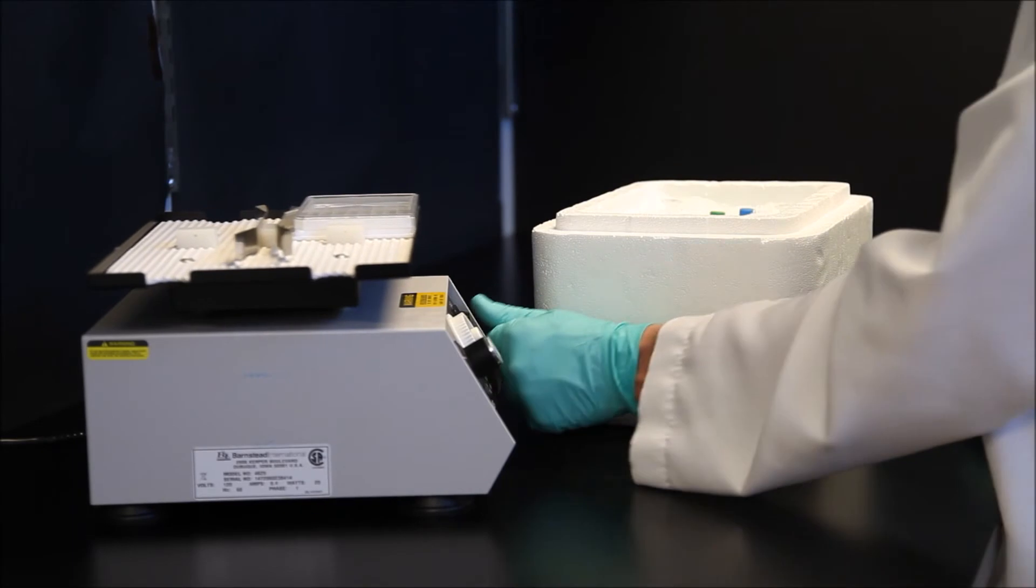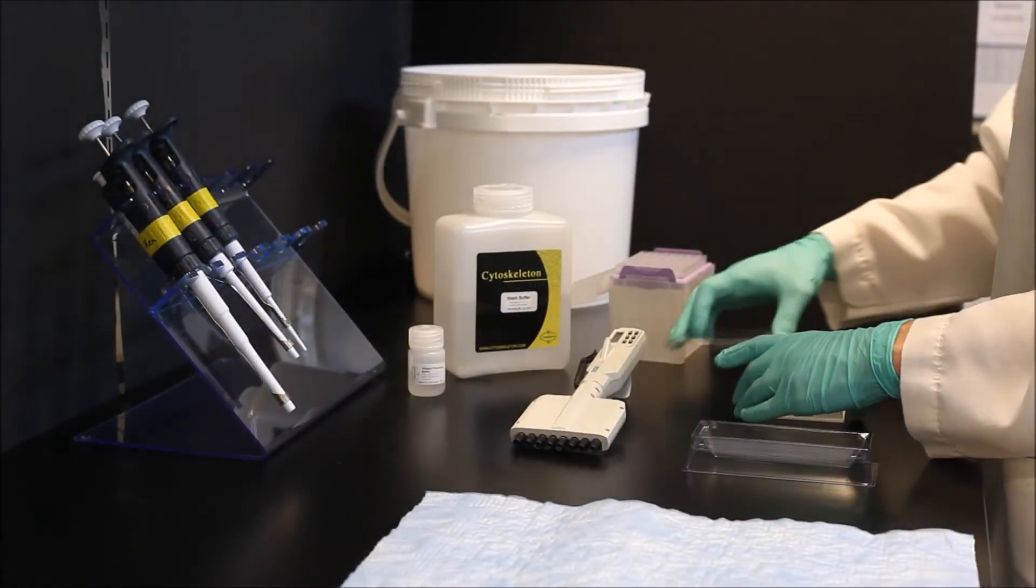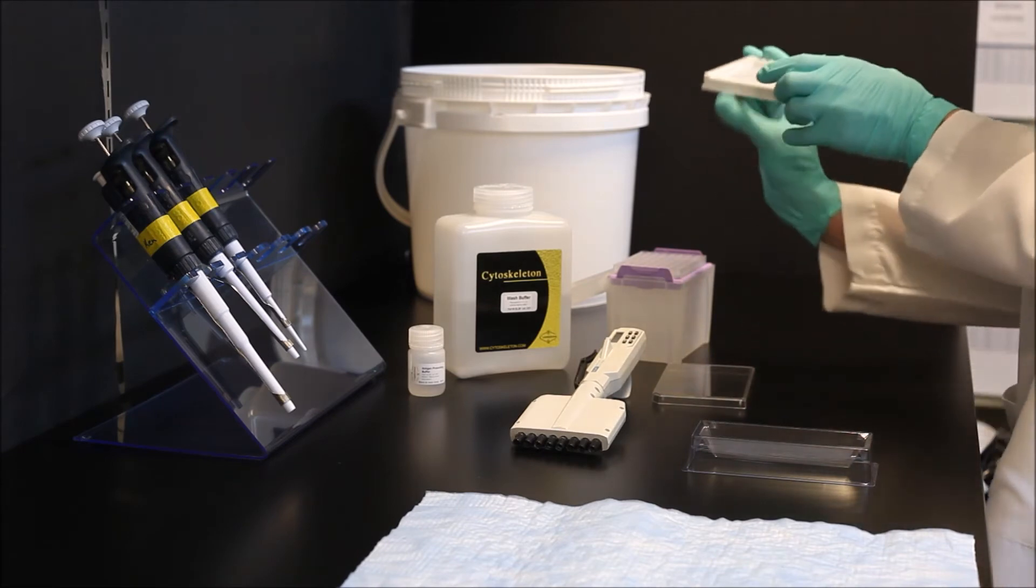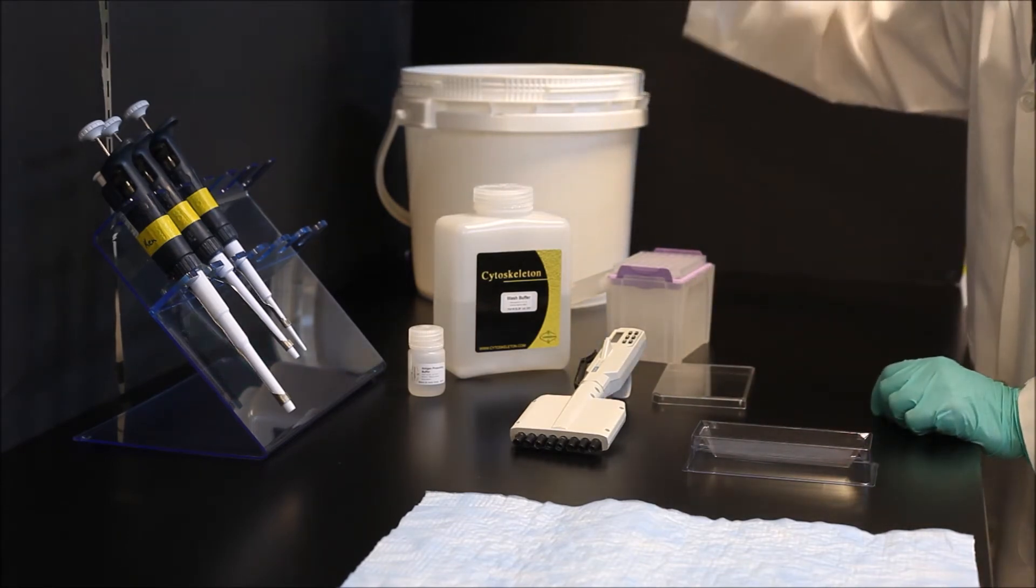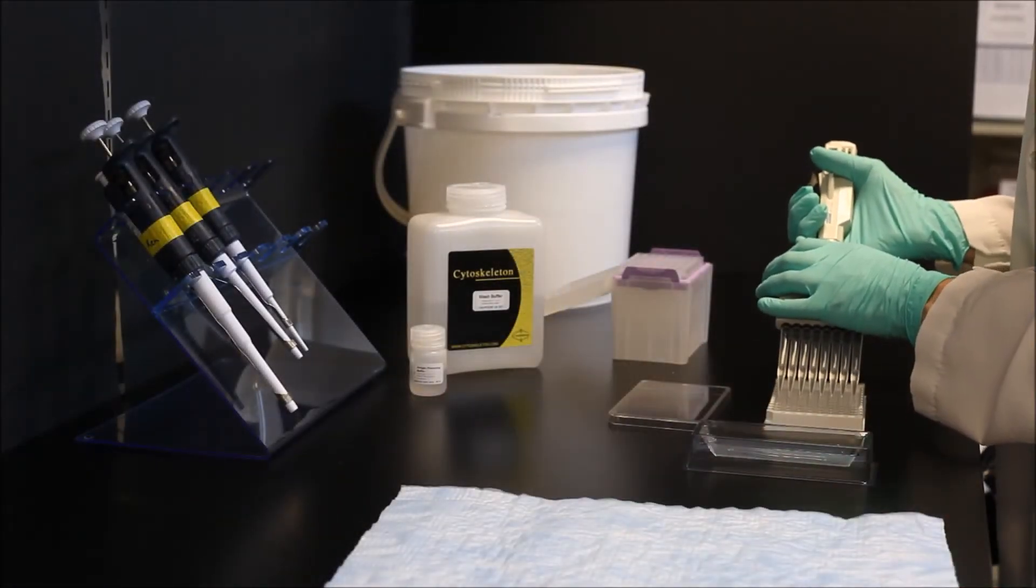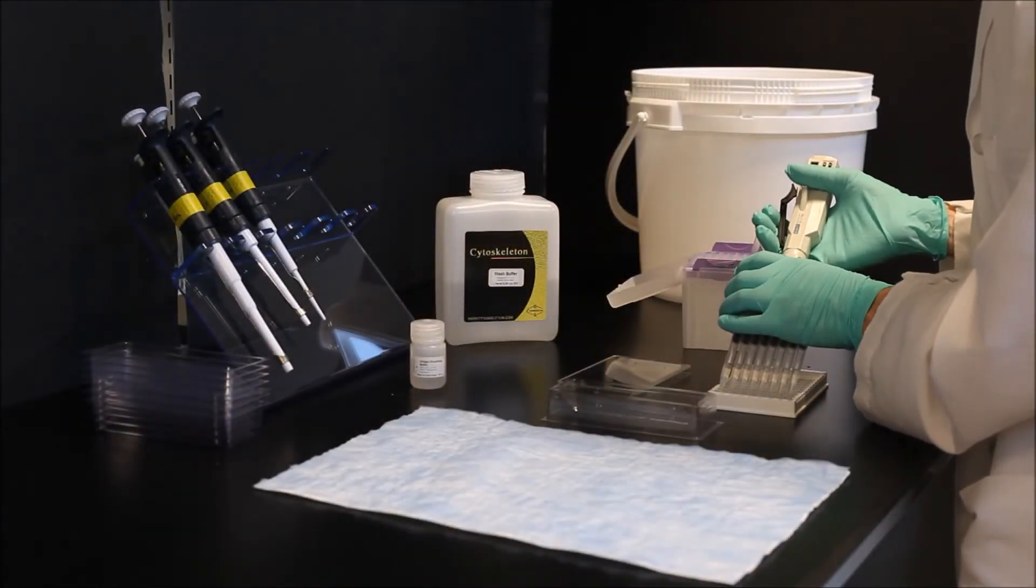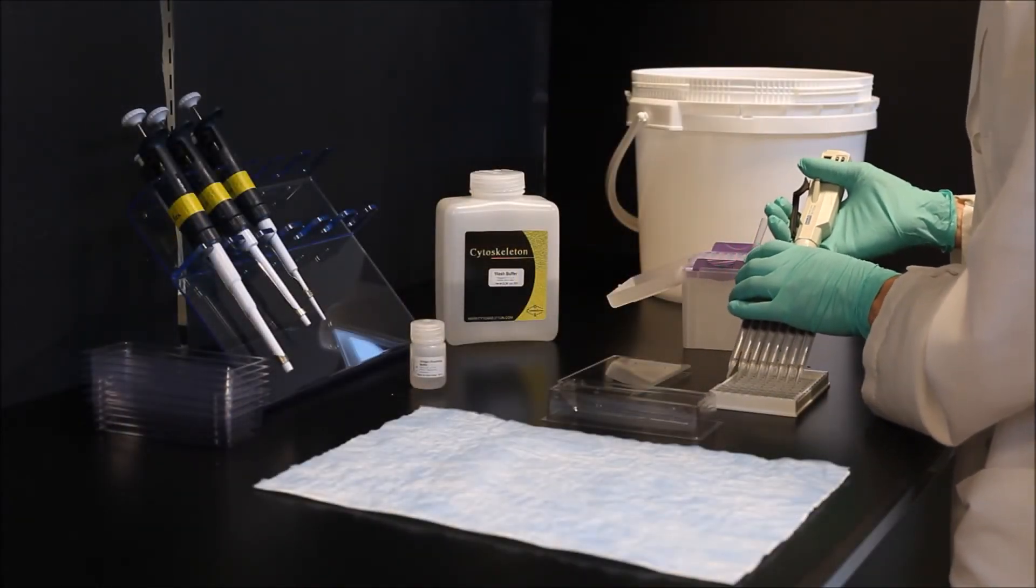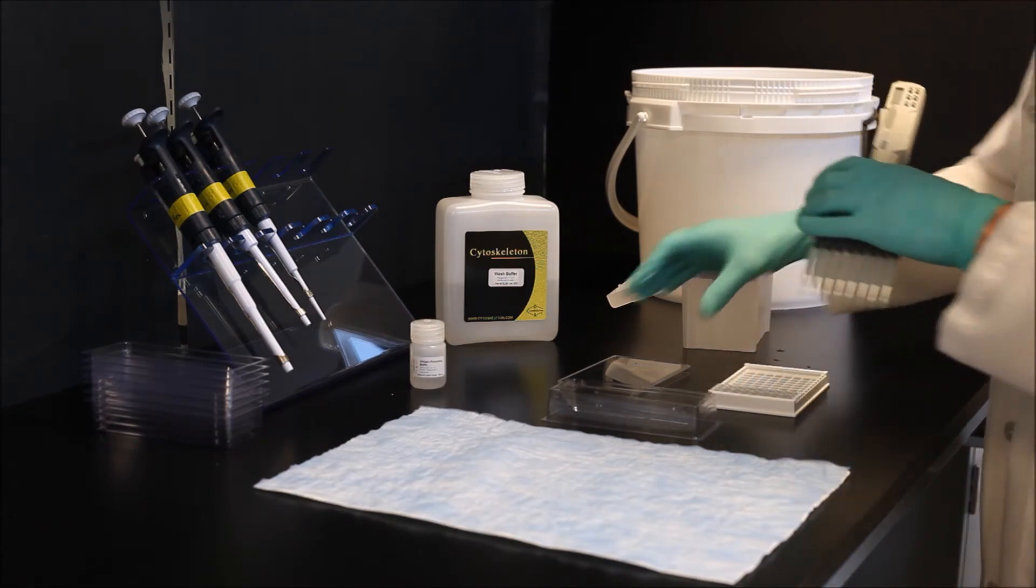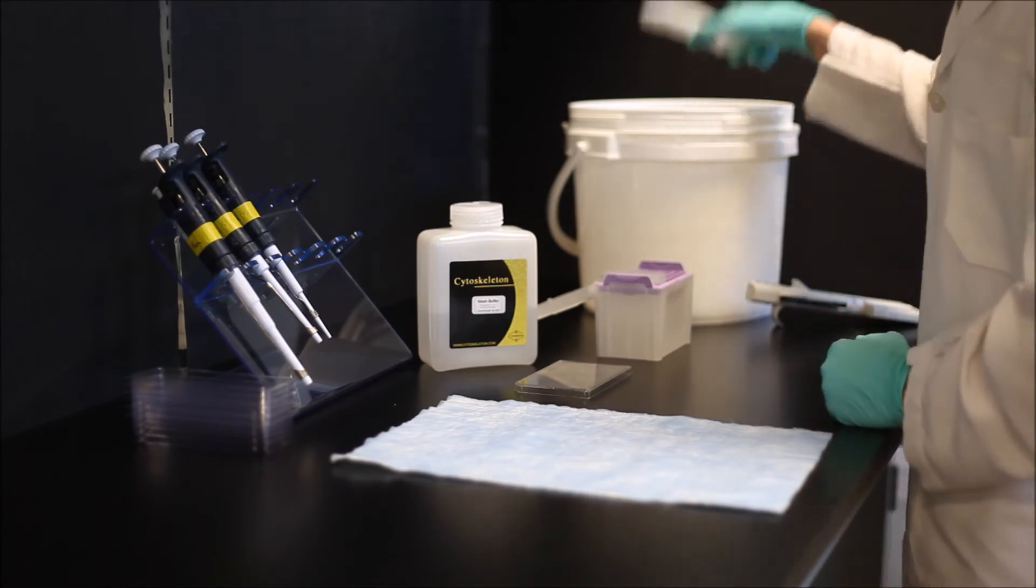After the 30 minute incubation, remove the plate from the shaker and wash the wells twice with room temperature wash buffer. Immediately add the antigen presenting buffer and incubate at room temperature for two minutes. These steps must be performed quickly to retain the most signal. Wash wells three times in room temperature wash buffer.